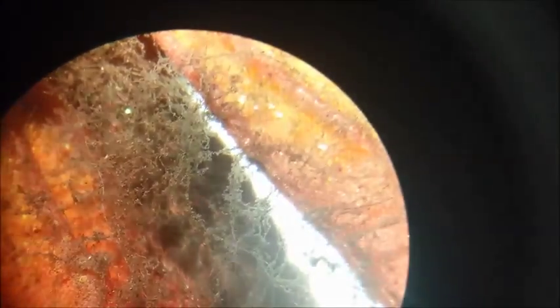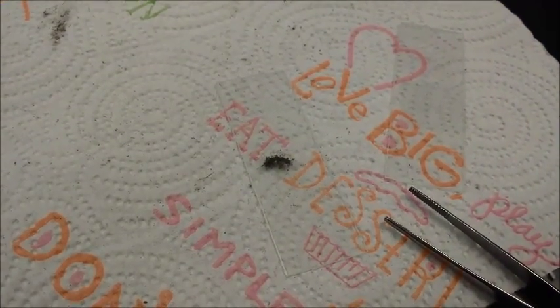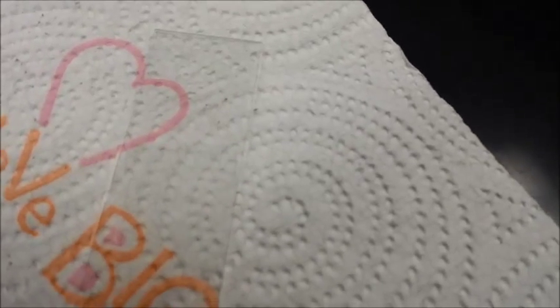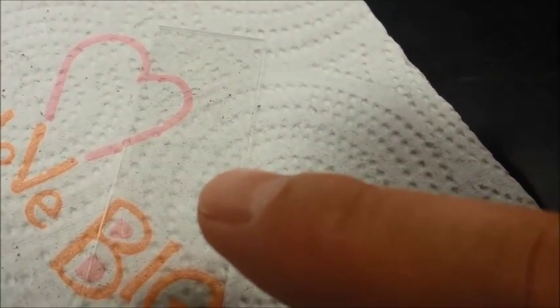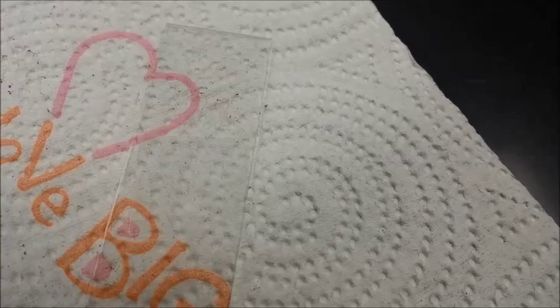It's the backlight that actually kind of kills me. I kind of get a pretty good idea of the nastiness here anyway. So I've got one slide that is just a clump of stuff. Take a look at that one. And then the other slide, it's kind of hard to see, but it has some little tiny detritus pieces in there. So I'm going to take a look at that under the microscope. Detritus, that's the best way I can call it.